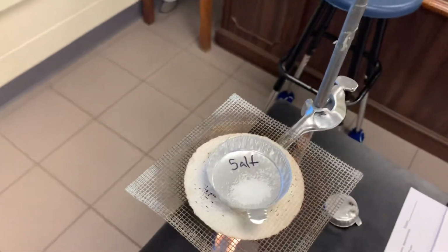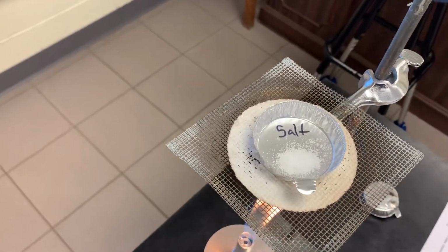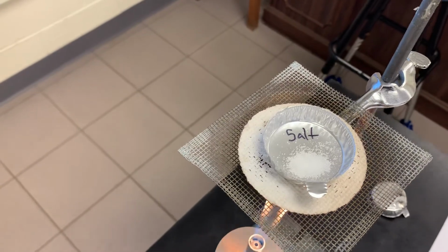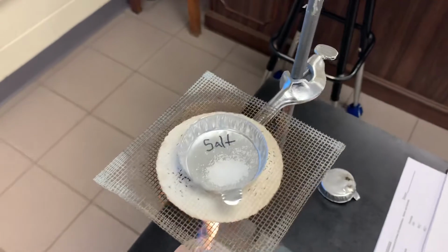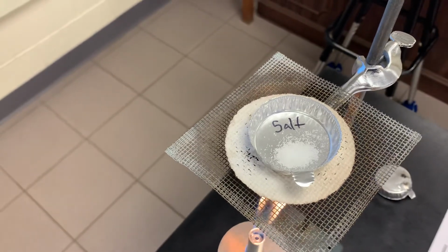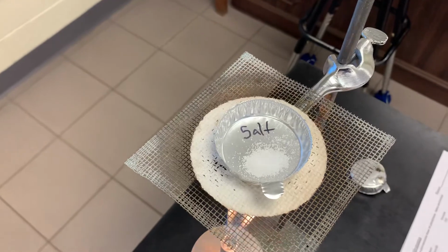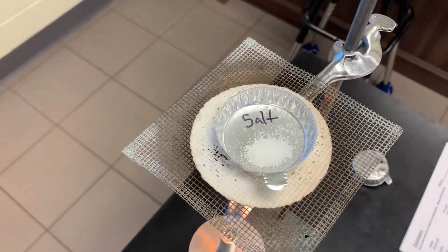All right. So we got the salt up here now. And we'll just watch it for a little while and see if anything happens with the salt. So you can see fairly quickly the sugar melted. Sugar has a pretty low melting point. You could try this at home, you know, don't burn your house down. If you want to, get a little bit of sugar and stick it in a pan on the stove or whatever, and you can see that it'll melt fairly quickly.